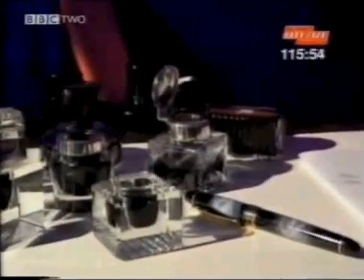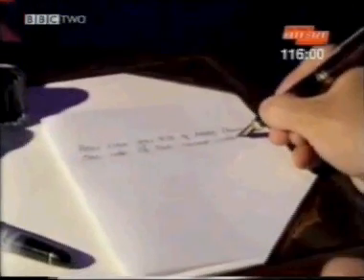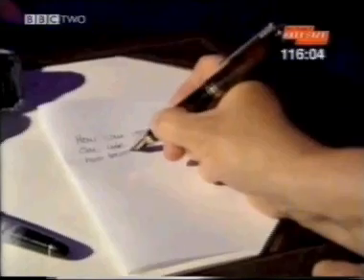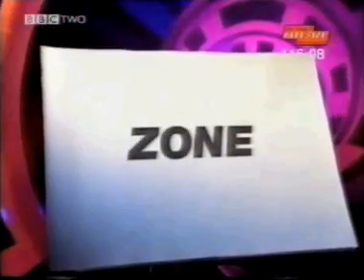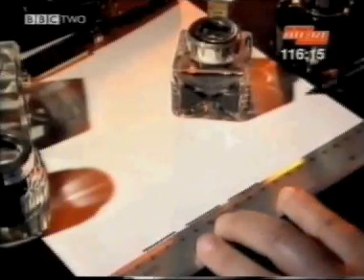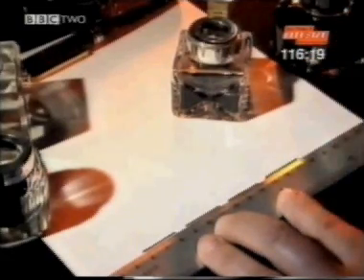Ink is a mixture of coloured dyes dissolved in water. The mixture, or solution, can be separated to show which colours it contains. It's then possible to find out what kind of ink was used. The writing on this piece of card looks as though it was drawn with one kind of black ink. We can test this by taking a sample of the ink used for each letter and placing it on a special paper that acts like blotting paper.